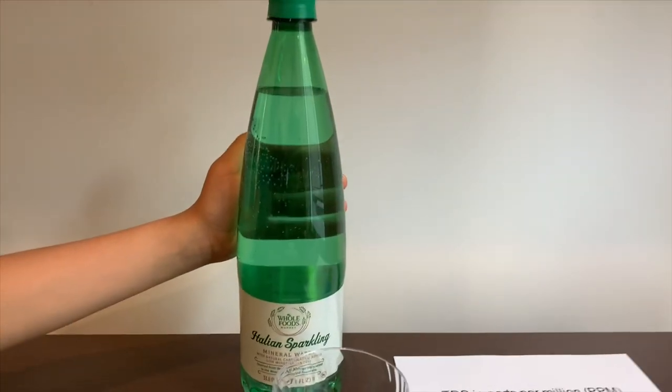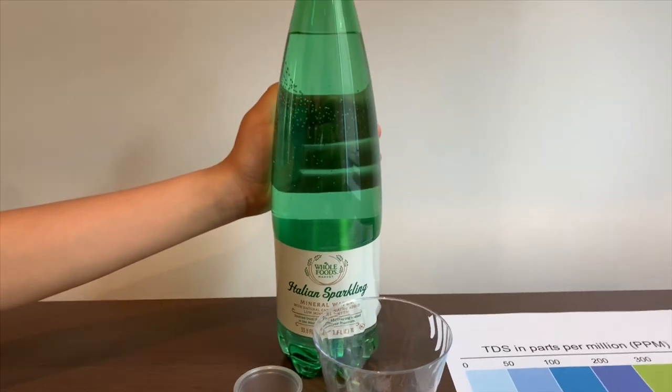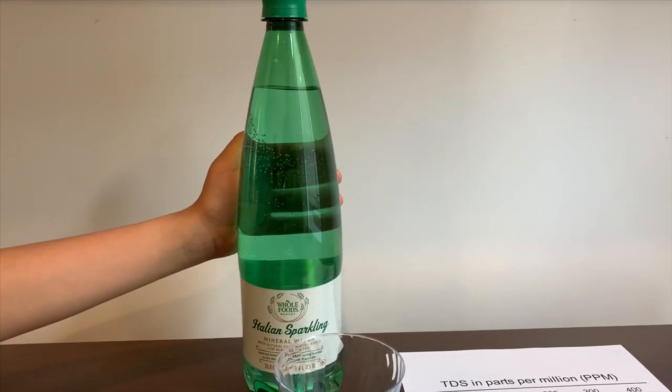This is Whole Foods Italian Sparkling Mineral Water. It costs about a dollar and it's sourced from Italy. Let's test the pH and TDS levels.